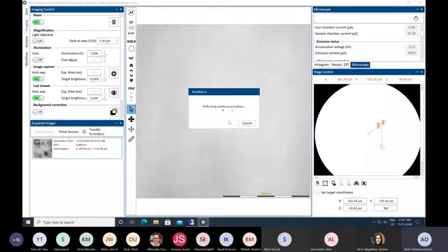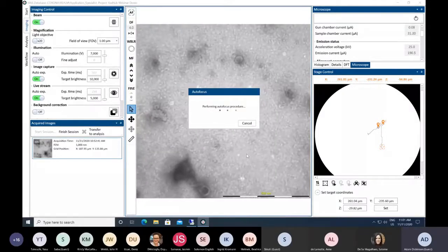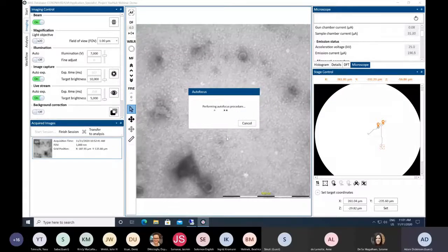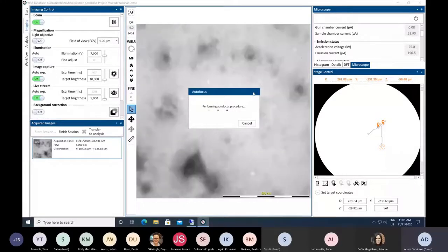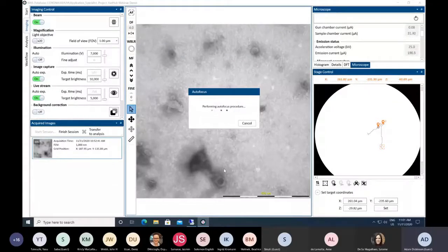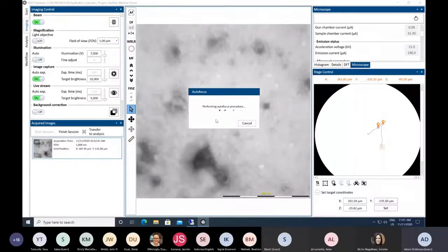So we'll just wait for the autofocus to finish. Need to get quite close now. So this particular region looks a little bit drier, probably not as optimal as the first two waypoints. So I may not particularly use this region. Doesn't look as good.